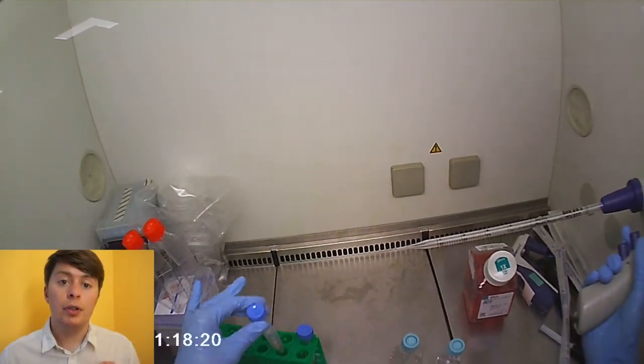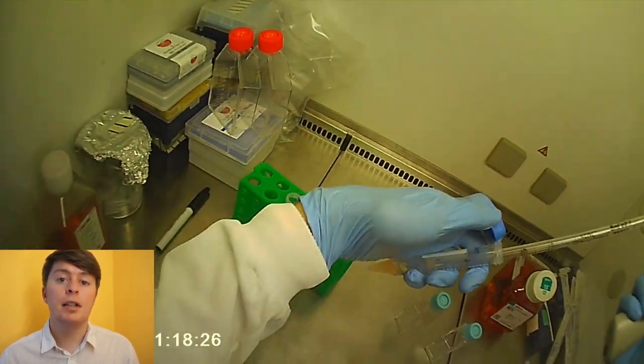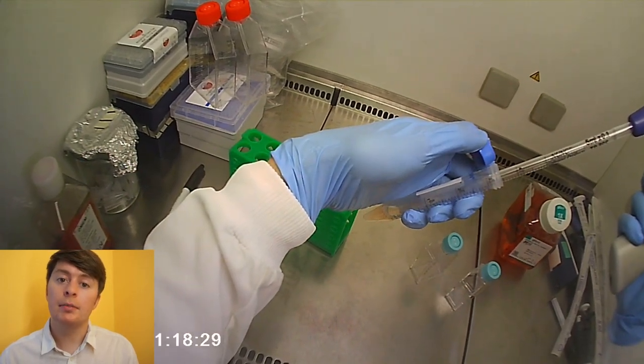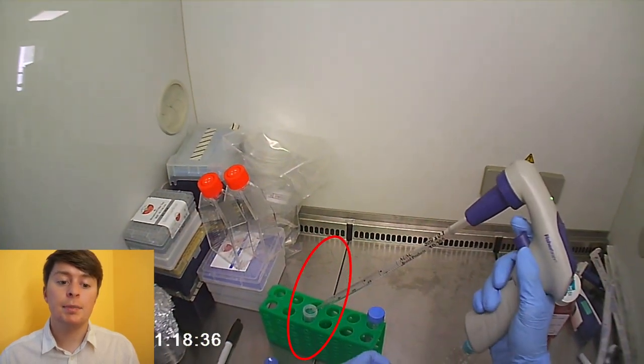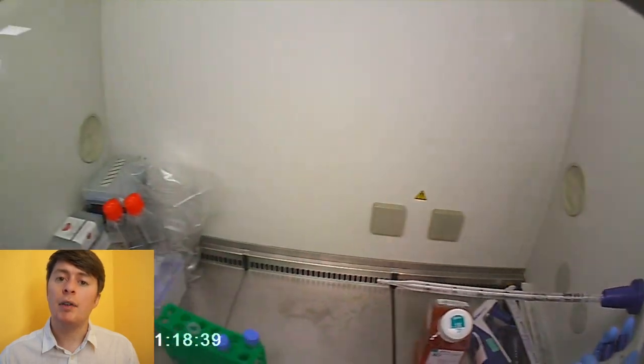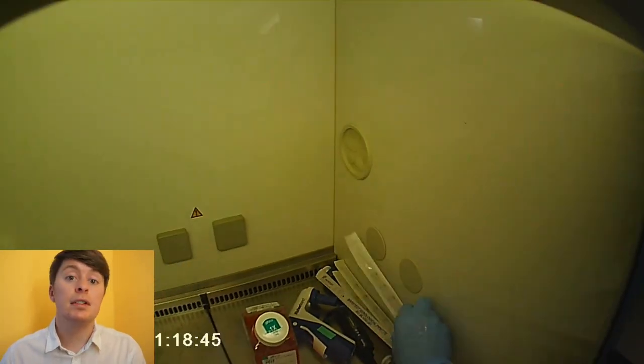So another thing I haven't mentioned is that I set up a small skinny falcon tube with the lid off in the hood. And the reason I leave the lid off and it's just there inside the hood is because it's just for waste. So when we remove that supernatant off the top of our pellet, we want to ensure that we have somewhere to put that liquid. Some people can use aspiration where you have a line where you can easily just suck the supernatant off and it's just deposited into a waste system, essentially, which is attached to the cell culture hood. But if you don't have that, just set up a small falcon tube and remove that supernatant and you can just deposit it in there and then dispose of it later.